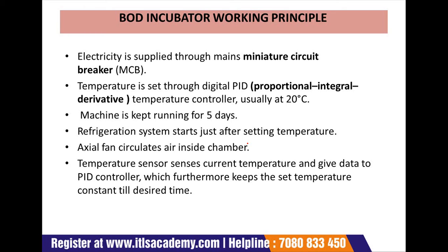What is the principle of BOD? So electricity is supplied through miniature circuit breakers, this is called MCB. Second principle is temperature is set through digital PID. PID is called proportional integral derivative. The temperature controller is usually at 20 degrees. The machine is kept running for 5 days, and the refrigeration system starts just after setting the temperature.